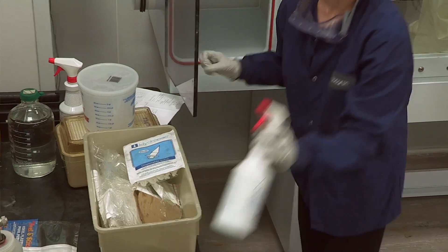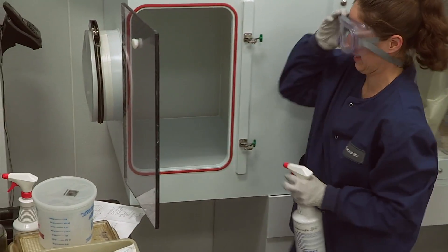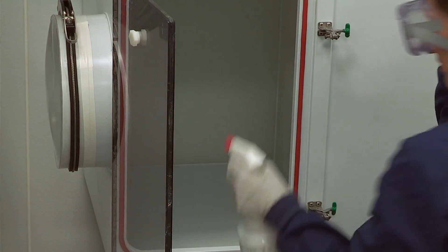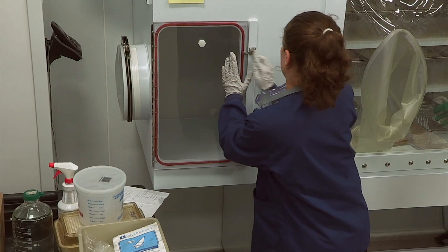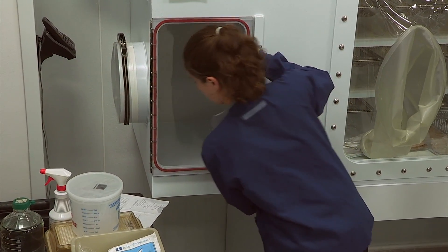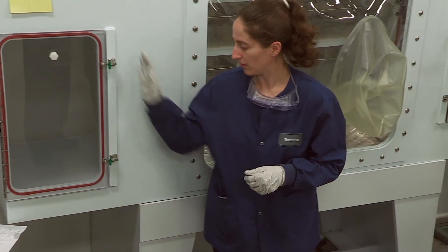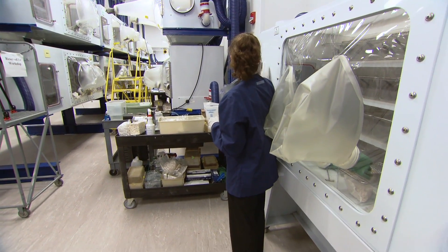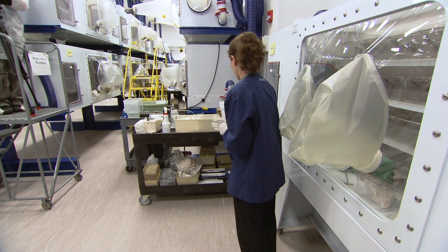Since I'm here and have the port door open, I'm going to go ahead and spray it again before I leave. If I had clean/dirty signage or a port isolator log, I could mark it on there that I sprayed the port clean and it was sterile as of this time.